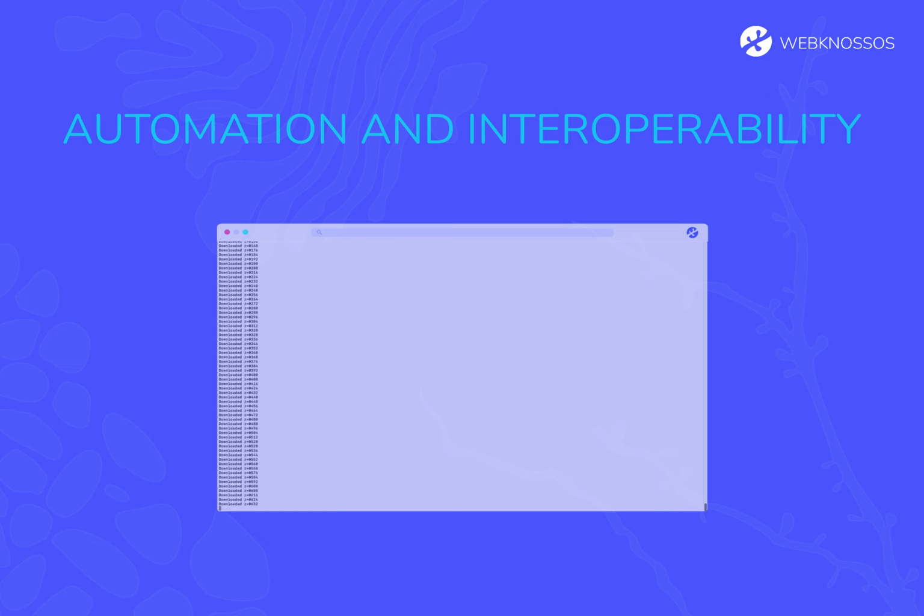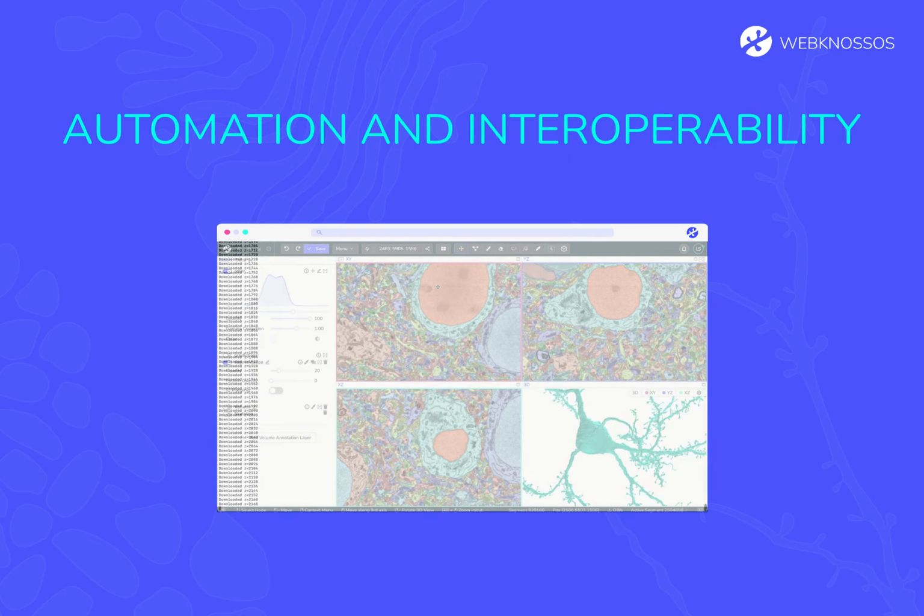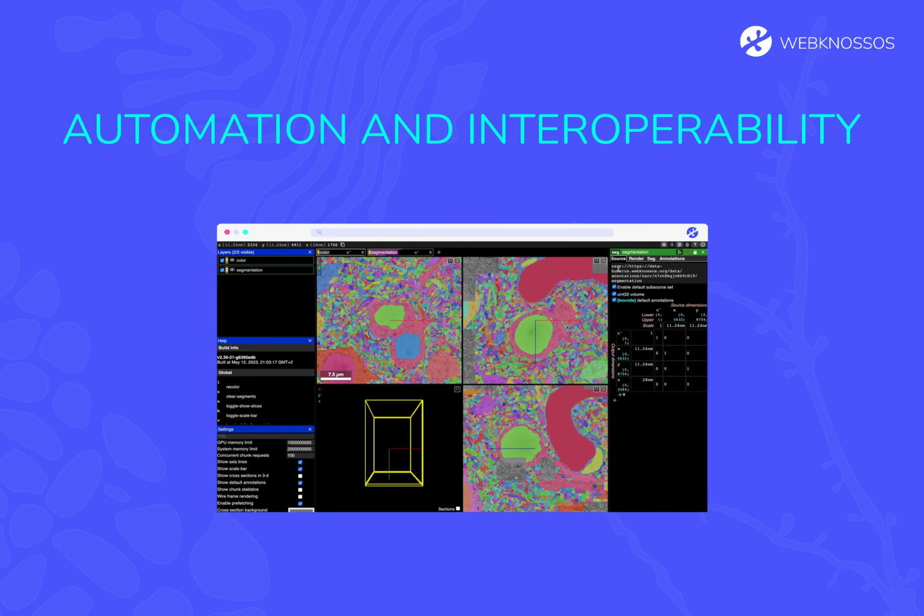WEBKNOSSOS effortlessly integrates with your data and favorite tools. In this video, you will learn how to download, import, and stream data from WEBKNOSSOS.